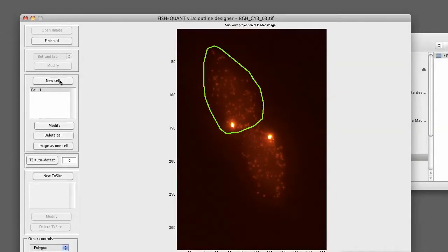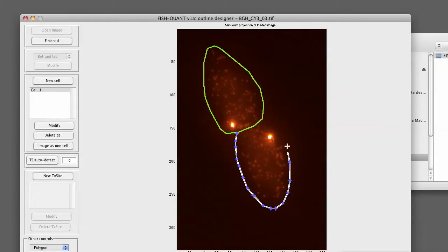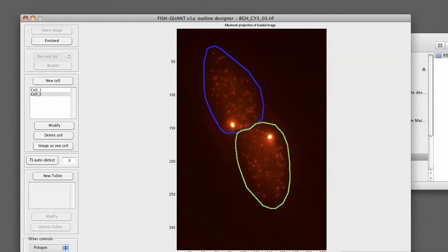Then we can set and define a second cell. We press again on new cell. We follow the outline. Again, we double click on the first point and we now have the second cell.